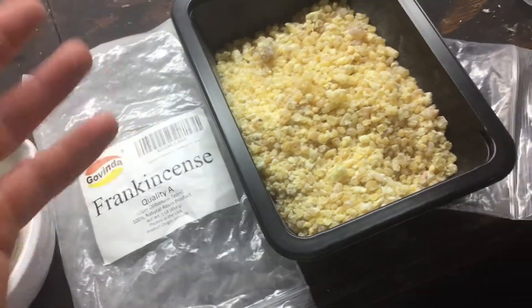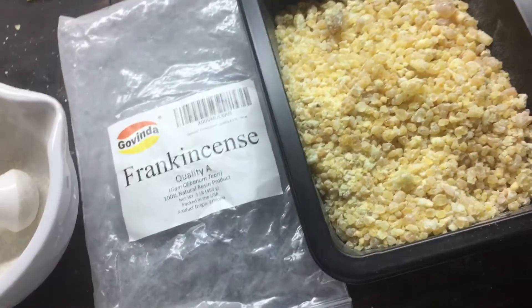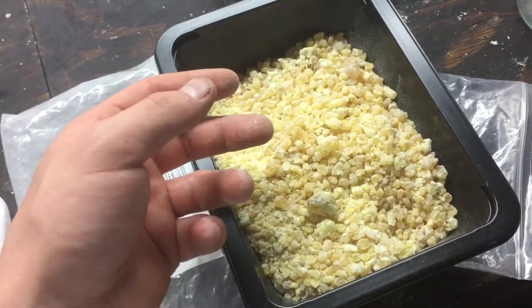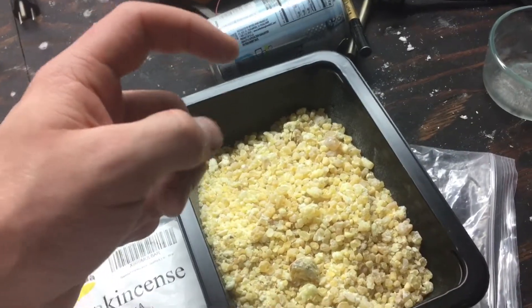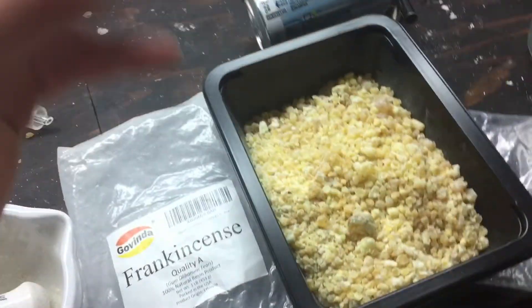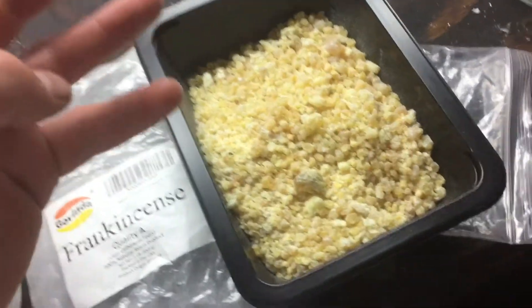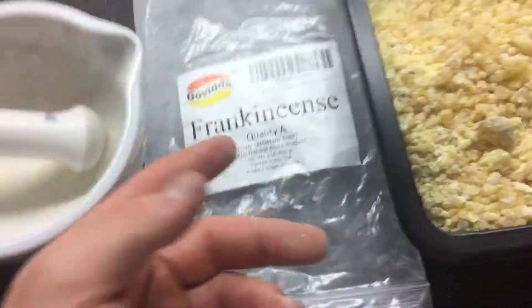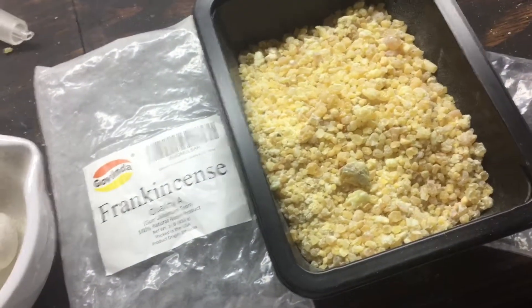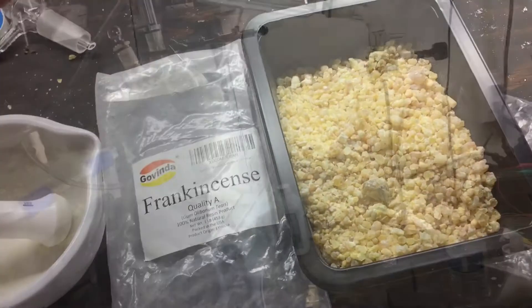That's because frankincense is literally tree sap from the gum olibanum tree. What these are is essentially tears of sap — they take some sort of tool and scratch the bark of the tree, thus opening it up allowing the sap to come through, and it hardens on the outside as a resin tear which can then be collected and hardens over time. That's how you get this really good quality grade A frankincense. So now I'm going to set up the apparatus and we can start the steam distillation.